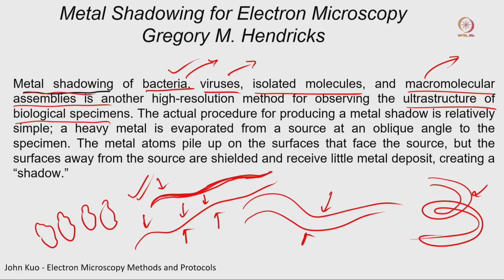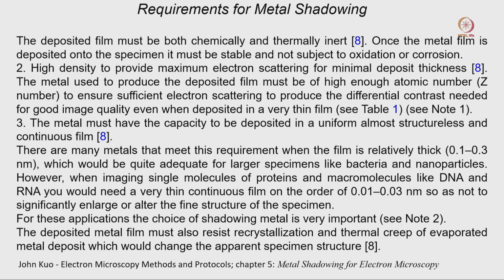And how can we do these things? You can follow my slides and get each and every detail of how to do this metal shadowing. I am not going to go line by line. I will just go to the equipment and describe how we can do this, and if you are interested you can read and follow this book also.